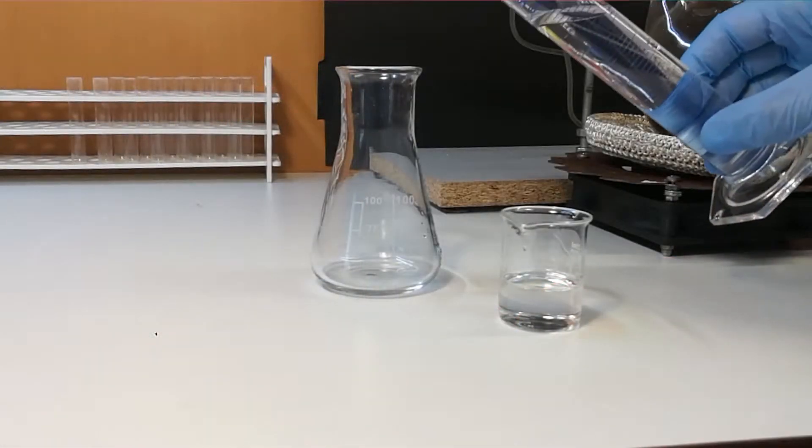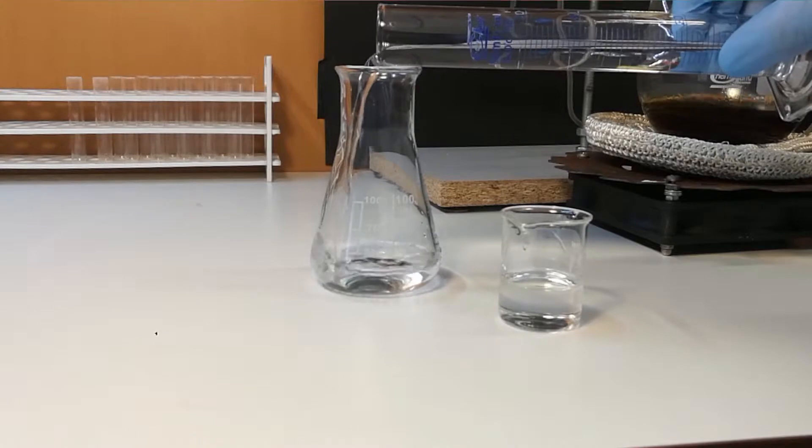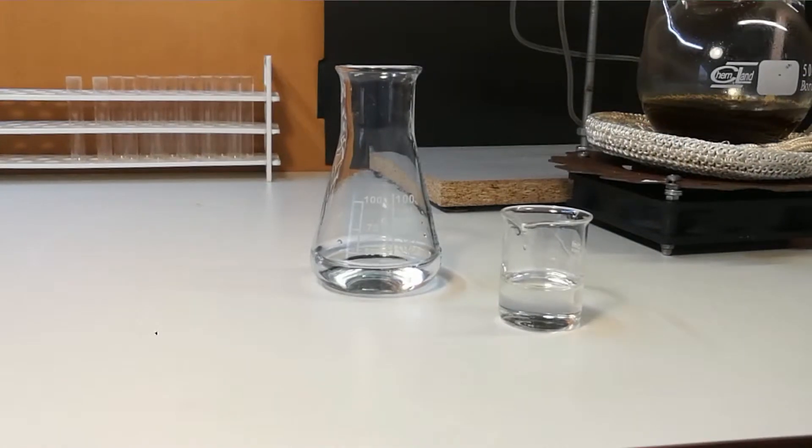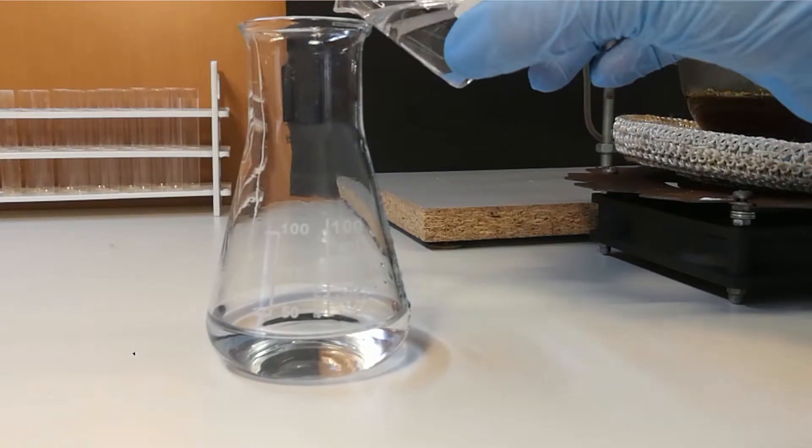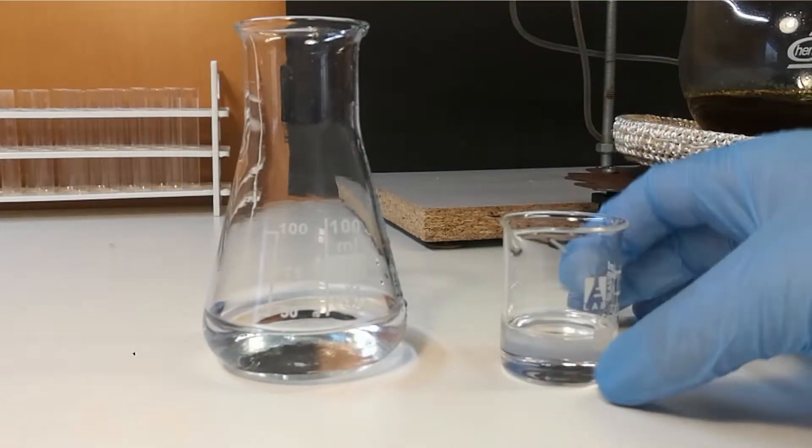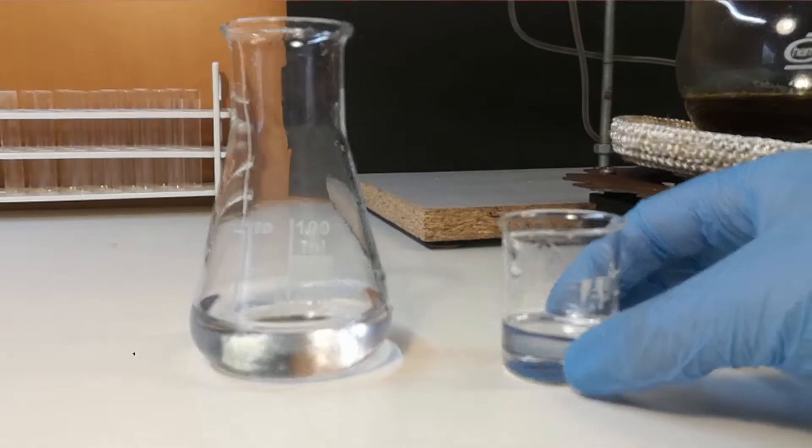In the meantime, we prepare sulfuric acid. Take about 15 grams of concentrated acid and gently pour it to 30 milliliters of water. Be aware of large amount of heat generated by addition of acid to water. Exact quantities are not necessary.